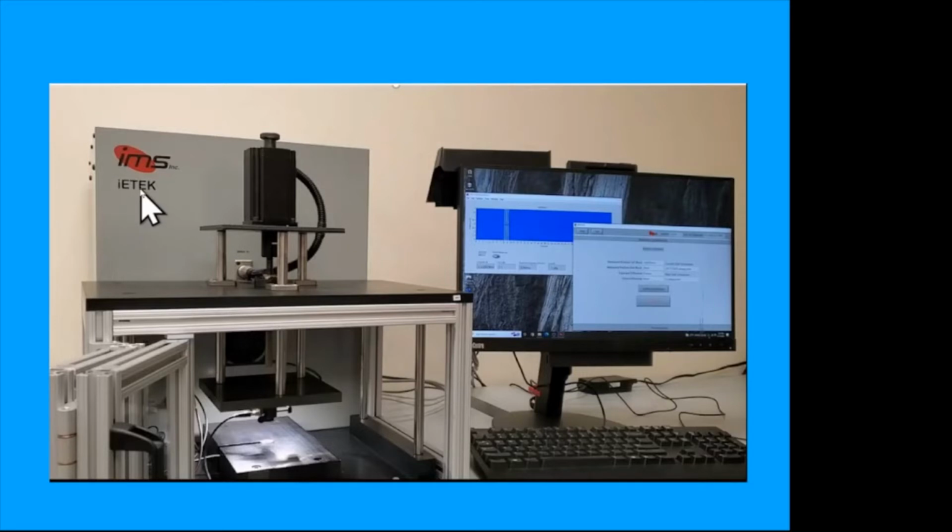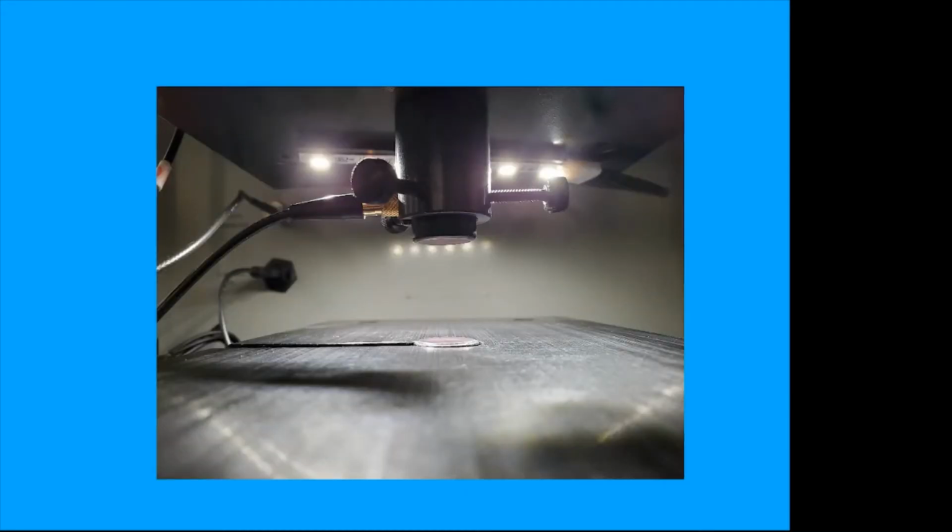This slide shows a close-up of the transducers. The lower transducer is raised up just slightly above the surface of the sample holding platform, and the upper transducer is aligned collinearly so that when load is applied, the brake pad seats with the transducers and the load is provided directly through the transducer interface.